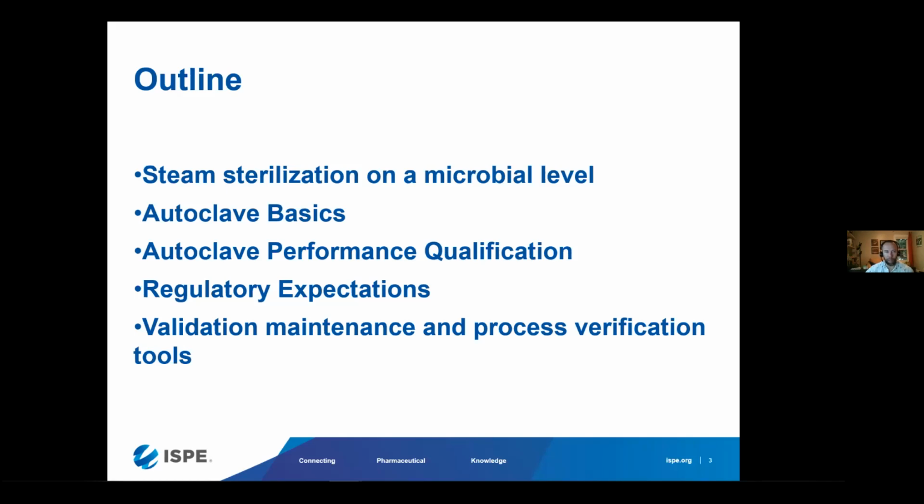So I'll start with an overview of the microbiology. I'll talk about some very fundamental basics of an autoclave design and function, and then move to really the most important part here, the autoclave performance qualification. This is the set of activities that we're performing in order to demonstrate that we have successful sterilization.